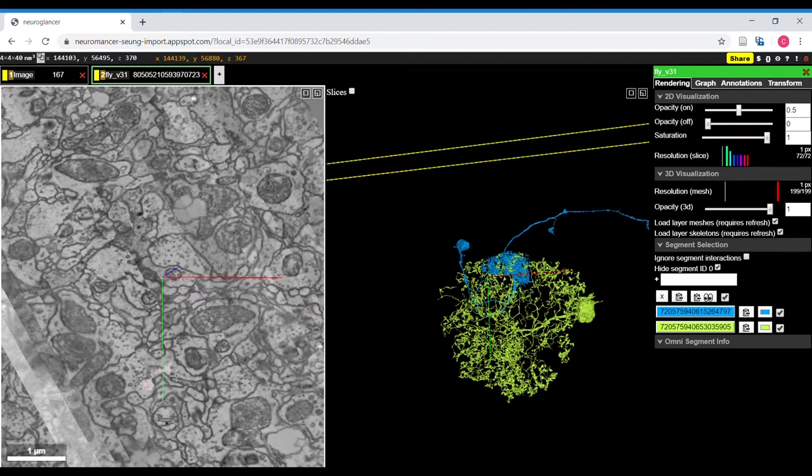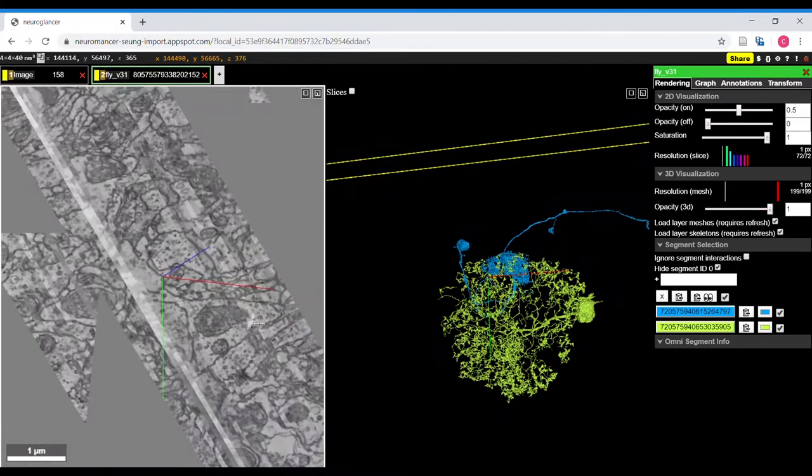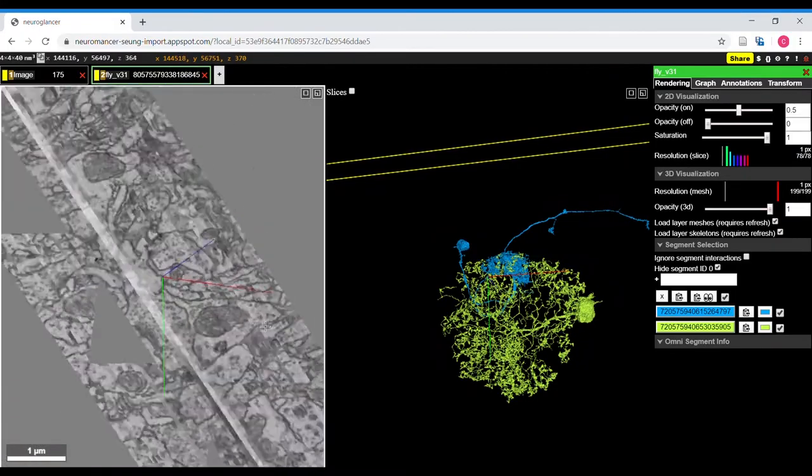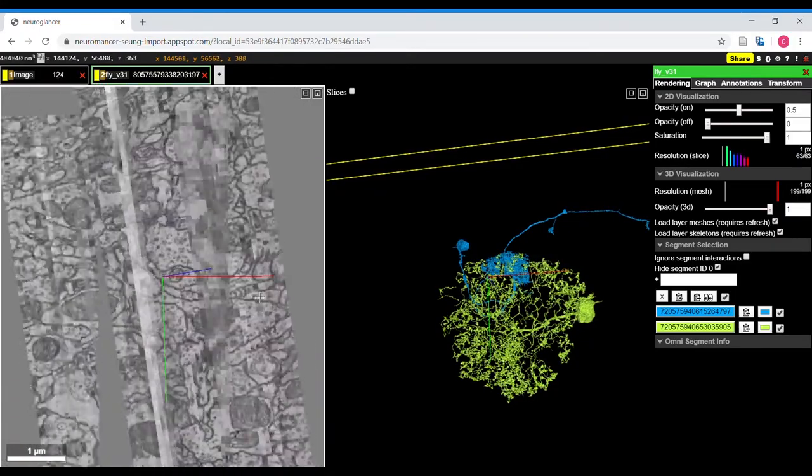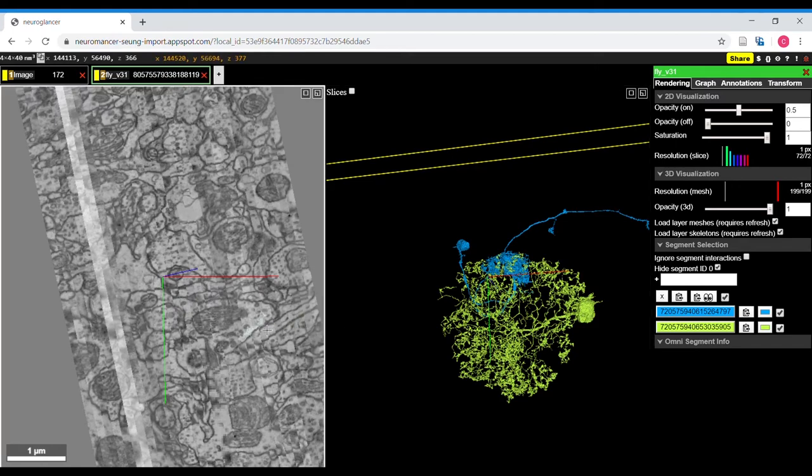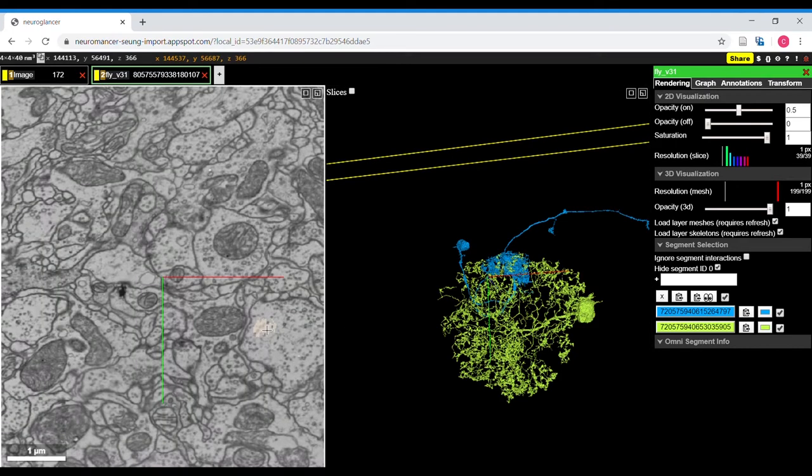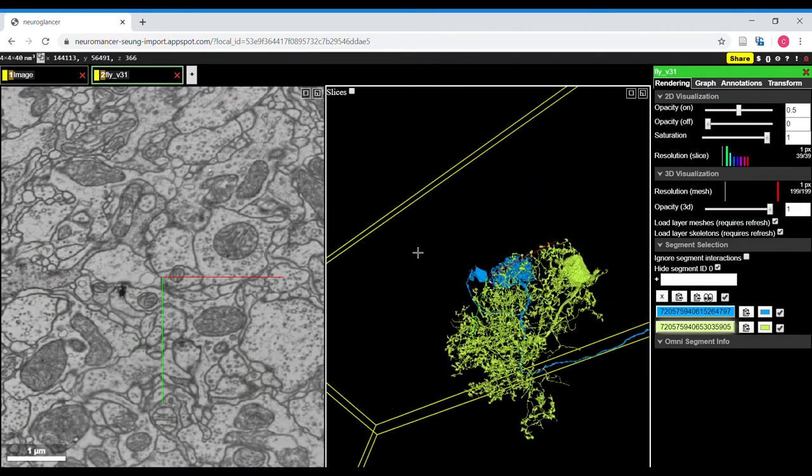The green axis is pointing down. And when you're close enough, for example like this, you can hit Z to snap to the nearest axis. Z also works in this window.